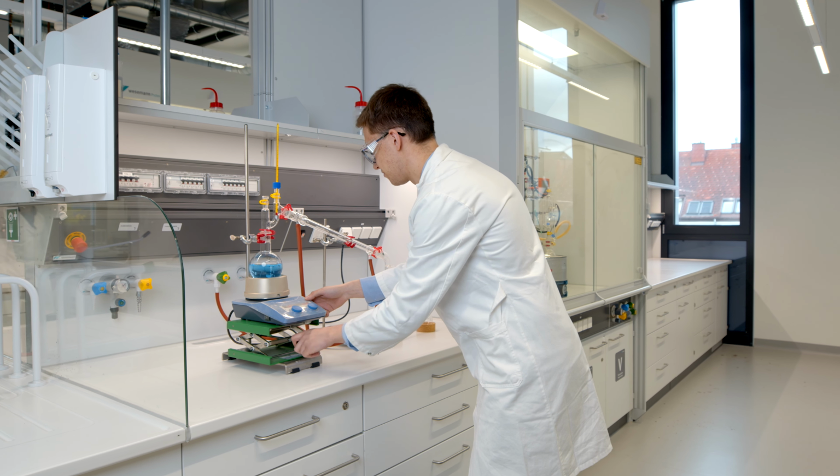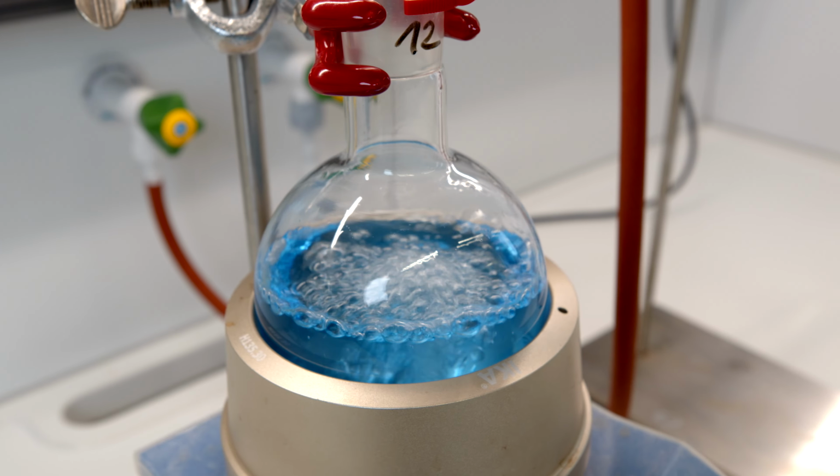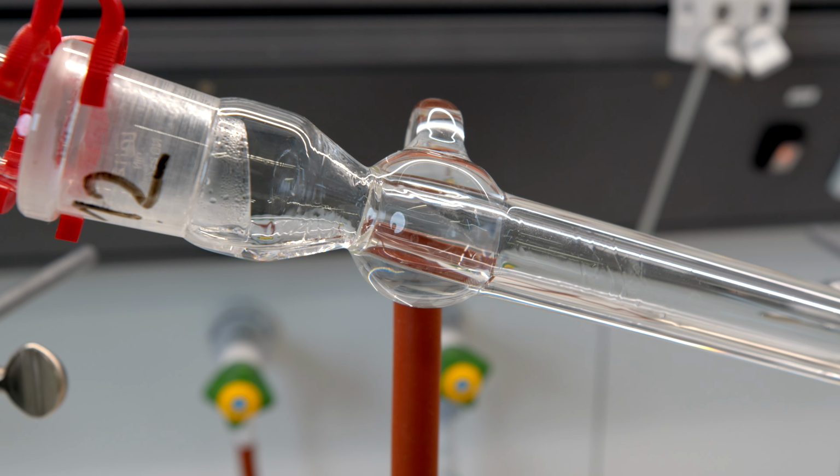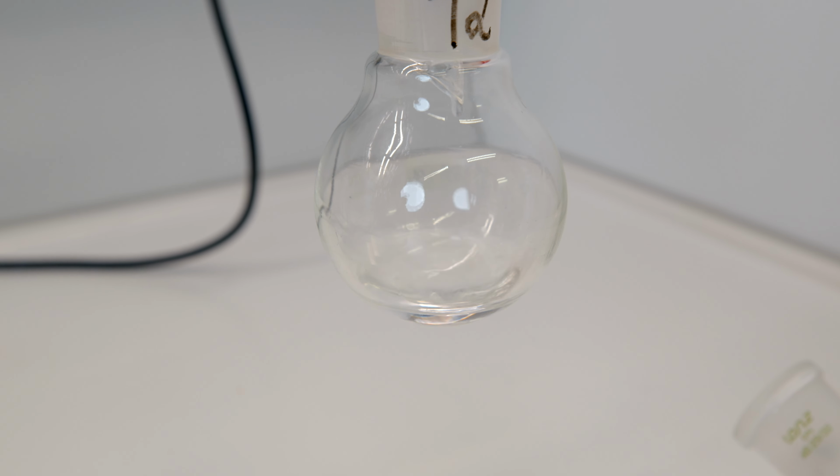We are here in our laboratory that's used for general chemistry and also for organic chemistry. You will spend quite some time here learning fascinating things. What you see here at this station is a distillation apparatus. I'm sure that most of you have already seen distillation. That's a very crucial technique to separate two liquids which have different boiling points.